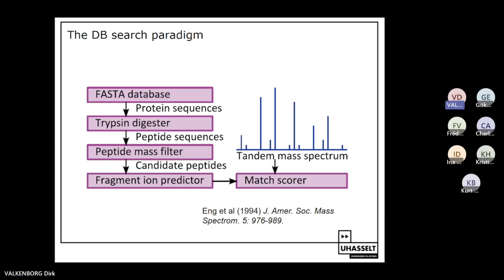That means these are the protein sequences that are most commonly agreed upon by scientists. Special isoforms or mutations that a particular individual has are not included in such a FASTA database. And therefore, our bioinformatics algorithm is blind to these findings.